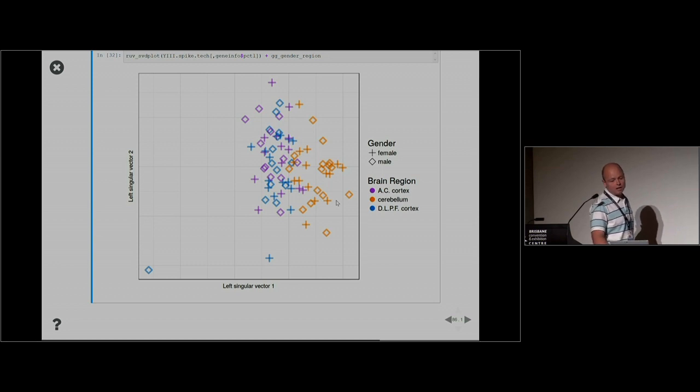Okay? What this means, and what we're going to see in the next couple of plots, is that by changing what I use as negative controls and what I use as replicates, I'm also, in some sense, redefining what variation is wanted and what variation is unwanted, and I'll end up with a different adjustment.